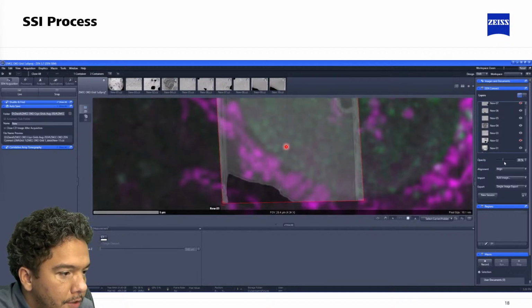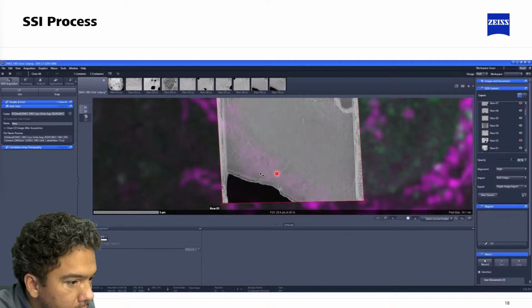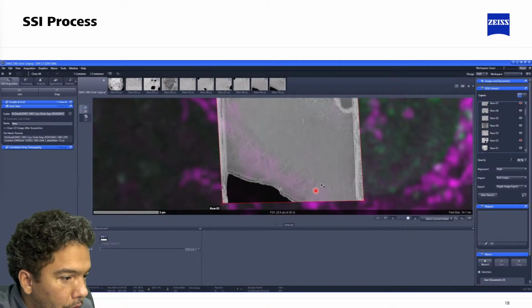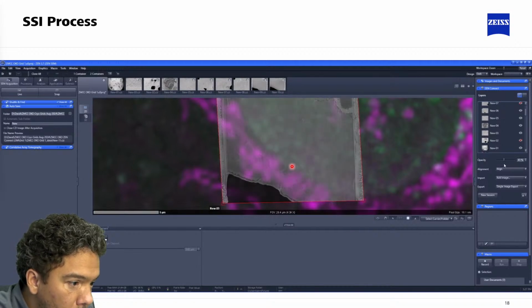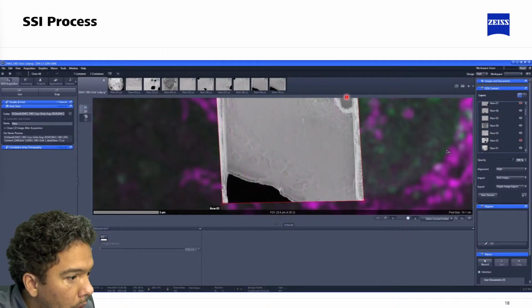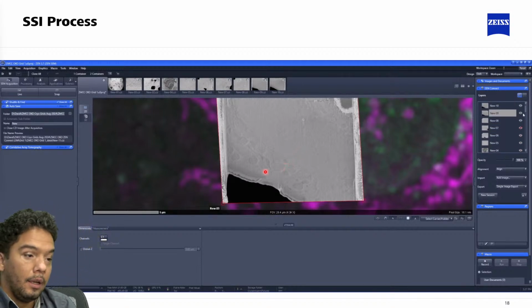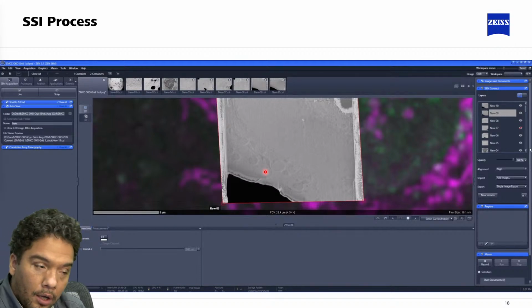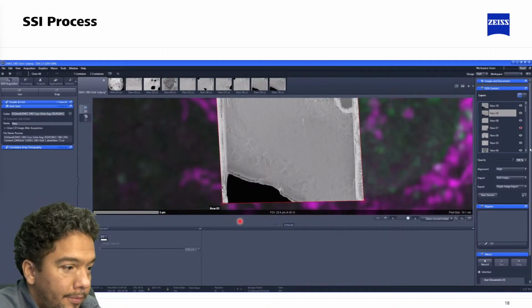We can move the transparency here, and we can see how the details of, for example, mitochondria look. This is the information from the confocal, and all the information here is the nucleus, the membrane of the nucleus, and other organelles, other mitochondria, and you can see how the information correlates. And that's very, very helpful. I mean, try to do this without the context. I don't know how you can do it without this technology.